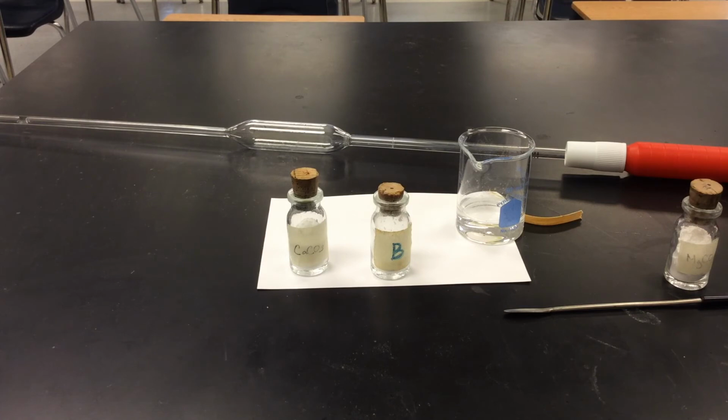is I don't quite care so much if they are exactly right with their unknown, but the 2 things I'm looking for, number 1, did they determine whether it was soluble or not? Magnesium and calcium carbonate are both insoluble, sodium and potassium carbonate are both soluble. So that's one of the things. If they say, oh, I think letter B is magnesium carbonate and it's actually sodium carbonate, I'm going to say, well, did you check the solubility? That doesn't make sense.